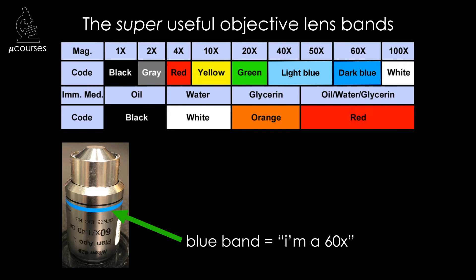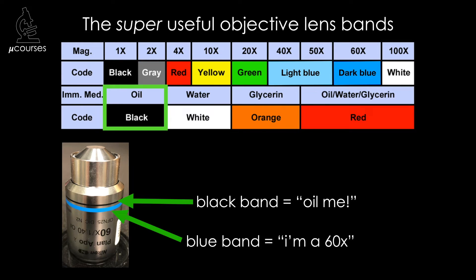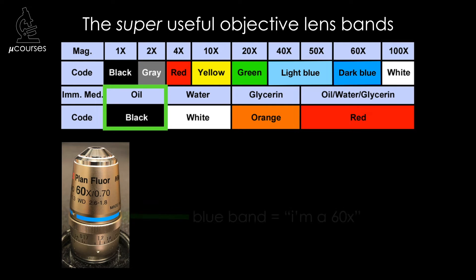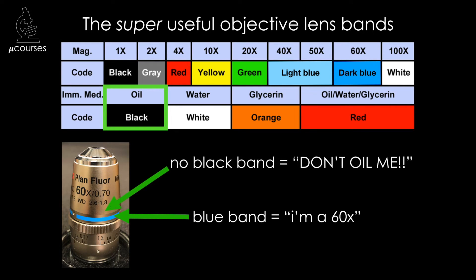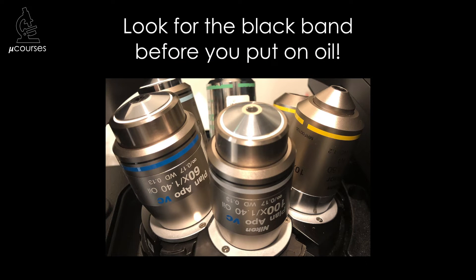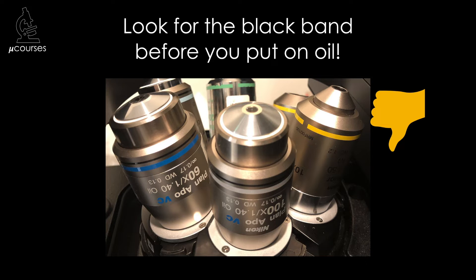Just above that band, the presence of another band tells you that it is an oil, water, or glycerin immersion objective lens — with a black band meaning that it's supposed to be used with immersion oil. If an objective lens is not meant to be used with immersion oil, it'll still have the band that indicates the magnification, but there will not be a black band or any band above the magnification band. So this makes it really easy: if you see the black band, oil the lens. If you don't see the black band, do not oil the lens.